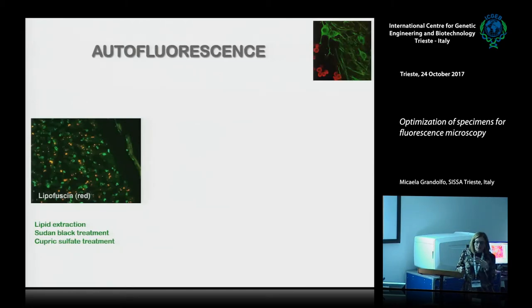But I think, in my opinion, if you have such a huge amount of background fluorescence, it is better to use a red fluorophore to see better, because the problem is that you can try, of course, if you want, to use a green fluorophore. But then you cannot distinguish, for example, some region in which you can suppose to have a very small amount of your antigen, I mean, of your fluorescence, from the background fluorescence. So, in my opinion, it could be a good idea to move to the red fluorophore.